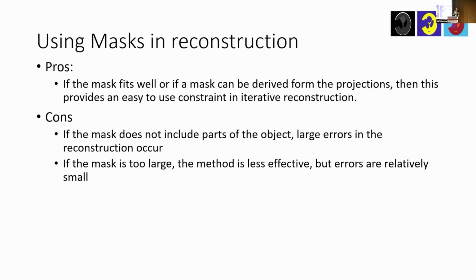All right, so that's how far you can go with masks if you want. Obviously, you can take all different levels, and we could make it all uniform nicely inside, and it would look very nice, but that's slightly unrealistic.